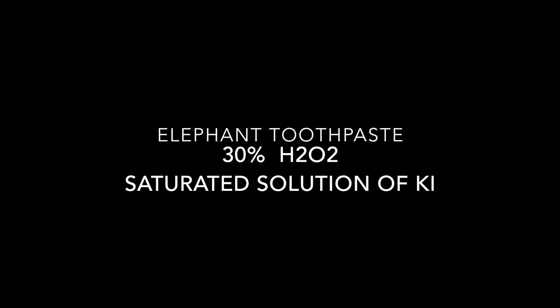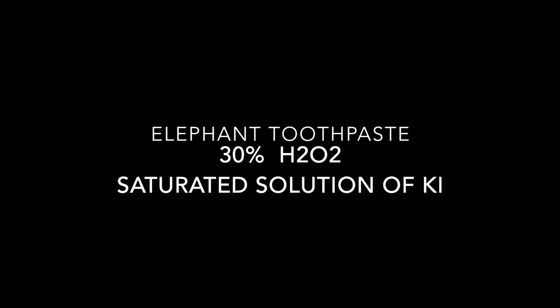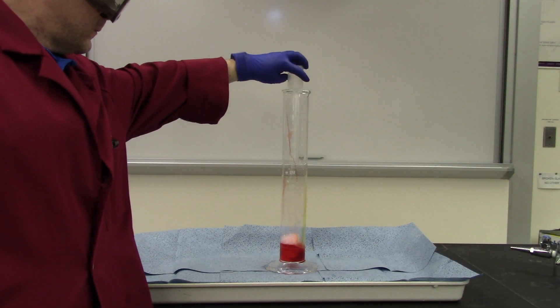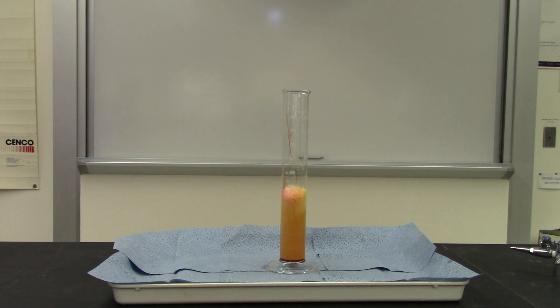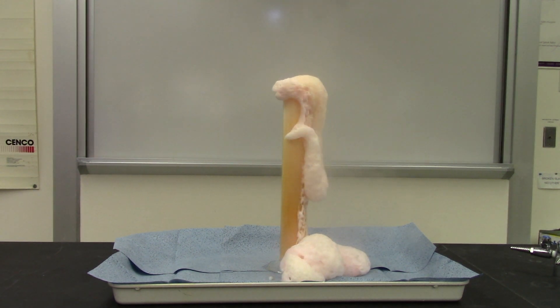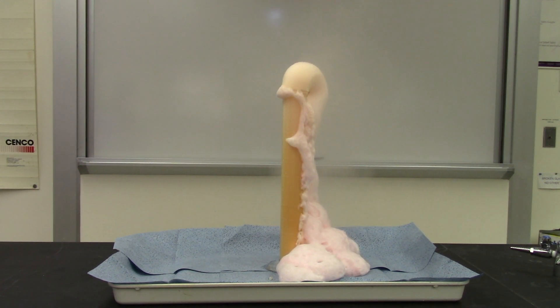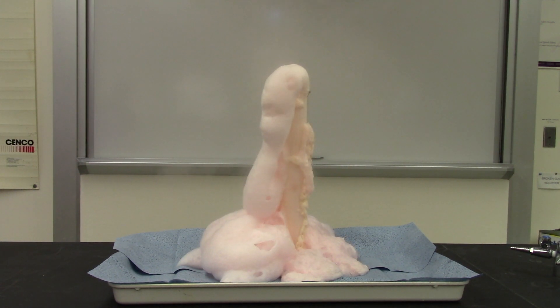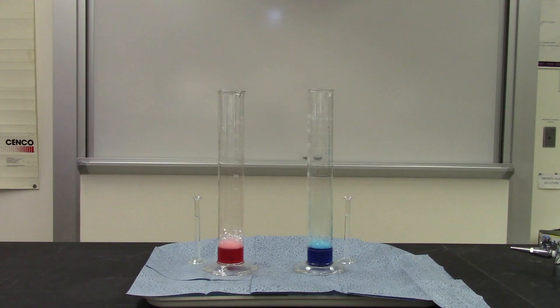Thirty percent hydrogen peroxide — this is chemistry-grade hydrogen peroxide. Danger, danger, danger! Warning: 30% hydrogen peroxide will cause severe chemical burns and permanent eye damage including total vision loss. Damage to property — walls, floors, plumbing — is likely. Do not attempt this experiment. Watch this. That kind of speaks for itself — that's really cool. Now, that's not smoke you're seeing — that is steam. This reaction gets extremely hot. Do not do this at home.